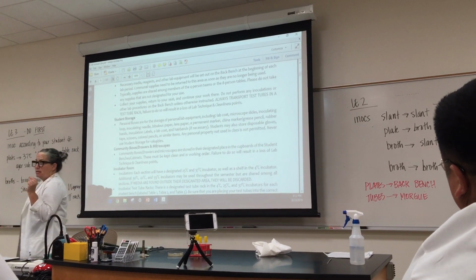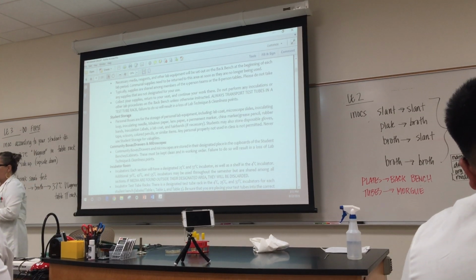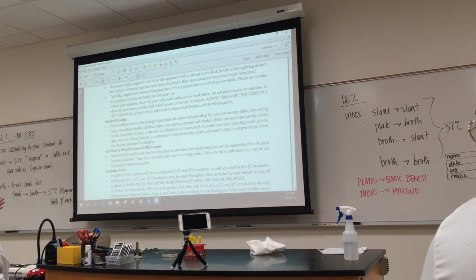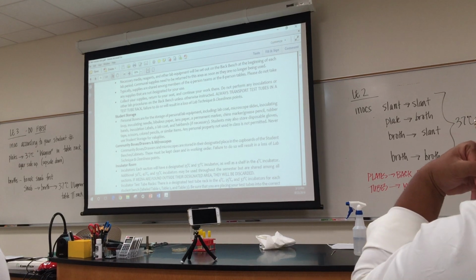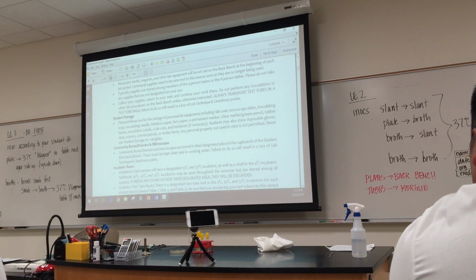Nothing that belongs to you belongs in that drawer. If your personal belongings, like your inoculating loops, go in that drawer, they're going to be in the garbage by the time you get back. So make sure that you don't put anything that belongs to you in the communal drawer. Your things go in the personal box, hence the name: personal box, community drawer.